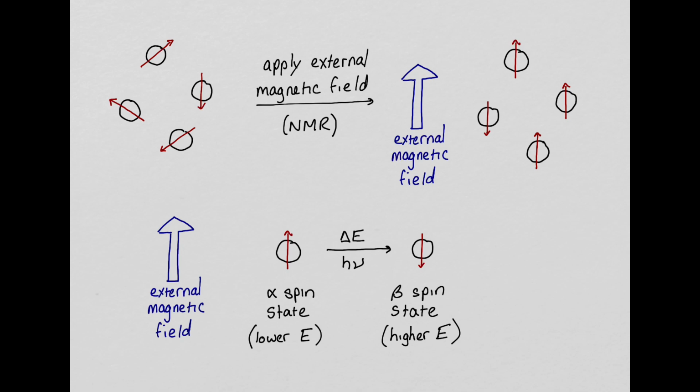Therefore, NMR can tell us about the chemical environment around a nucleus, because it can tell us about the amount of electron density around that nucleus, which is directly affected by the other functional groups in the molecule. Nuclei that have nearby electronegative groups will have less electron shielding because those electronegative groups pull electron density away from the nuclei. Conversely, if there aren't electronegative groups near a nucleus, it will have more electron shielding because it will have more electron density around it.